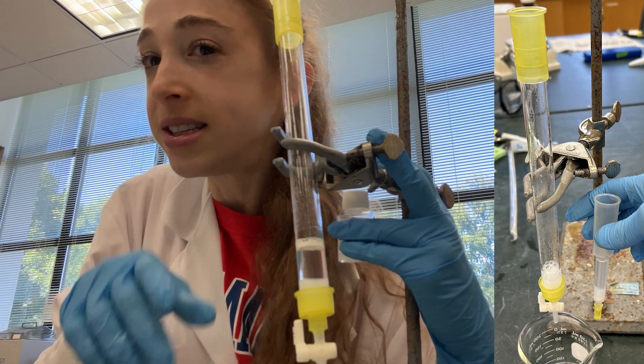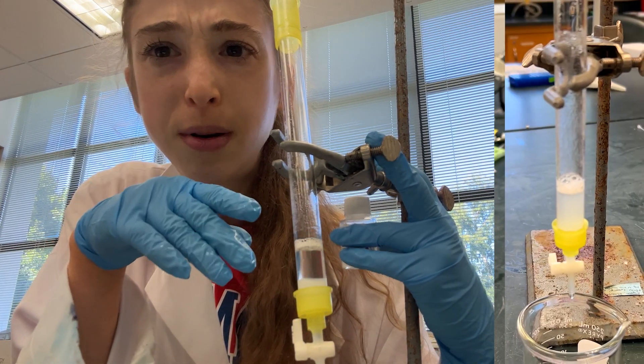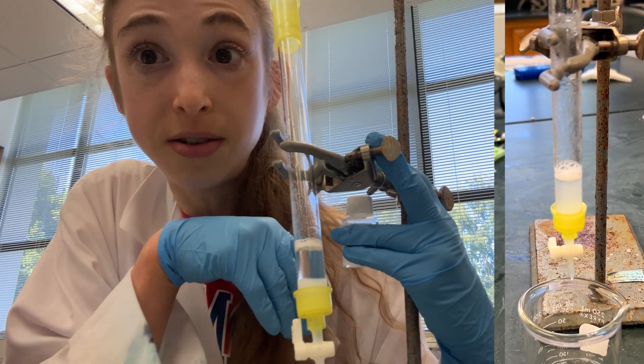If you need more exact column volume calculations, I'll have a link to a site with a post on calculating it more accurately. But for this purpose, just an estimate is okay.